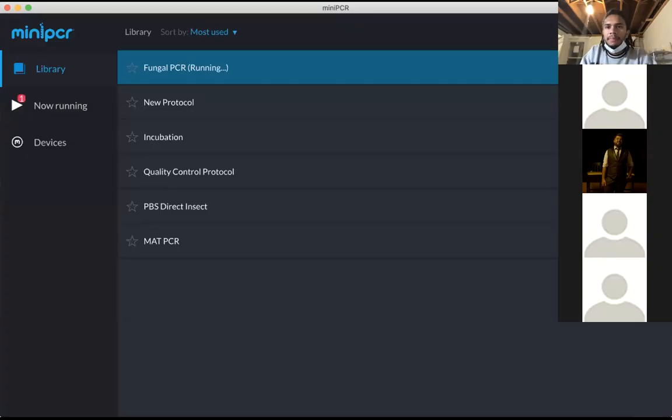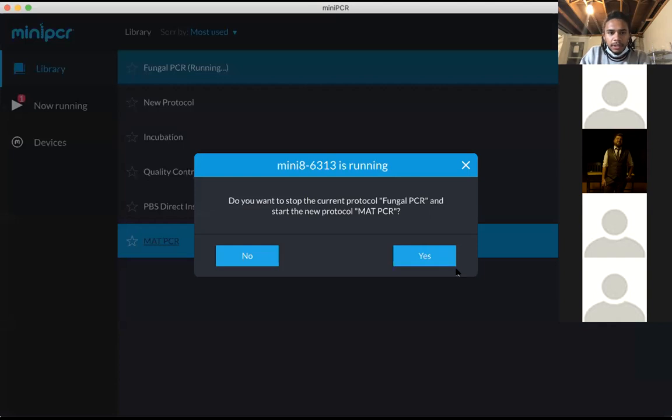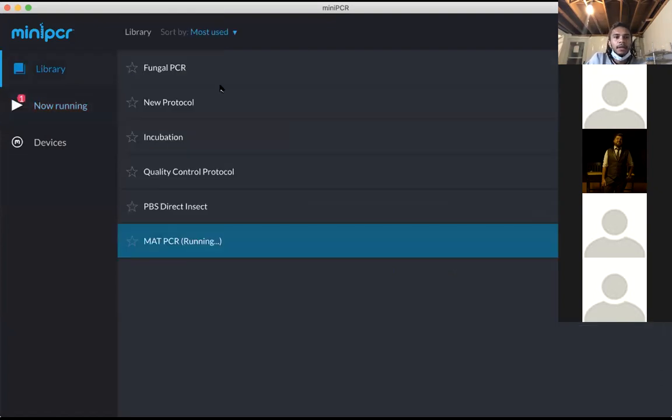All right, so this is the mini PCR program, and it's running fungal PCR right now, which I don't want it to do. So I'm gonna go to Mat PCR, which I already pre-programmed, and I'm gonna hit run. It's gonna say, you wanna stop fungal PCR? Yes. With the mini PCR, because it can run without the computer, you need the computer to program it what to do, but because it will run without the computer, when you plug it in and you turn it on, it's gonna run the last program that you had. So all these different programs tells it what to do.